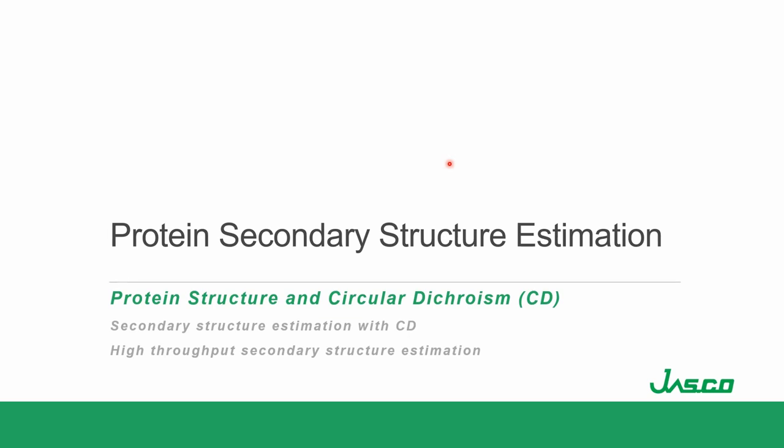And what we'll find there is it's really analogous to what's done with the FTIR, which is one of the strengths of having this in-house algorithm that we have. And then I'm going to give a concrete example of use of that secondary structure estimation software in a high throughput setting, where we're looking at a high number of samples that we want to get secondary structure estimations on very quickly.